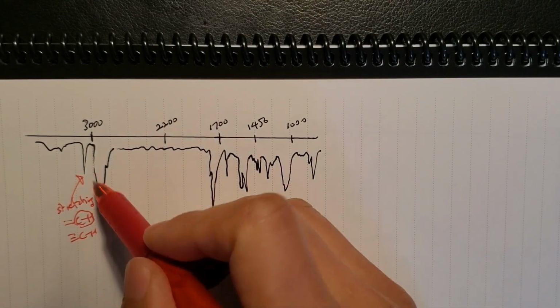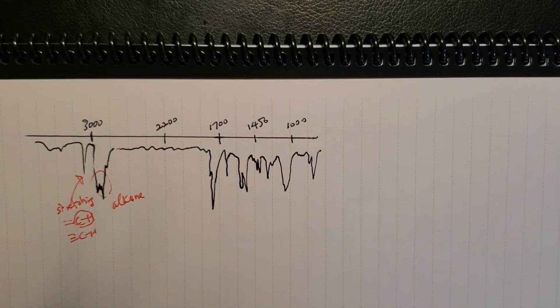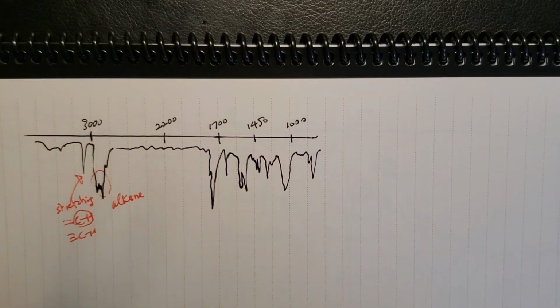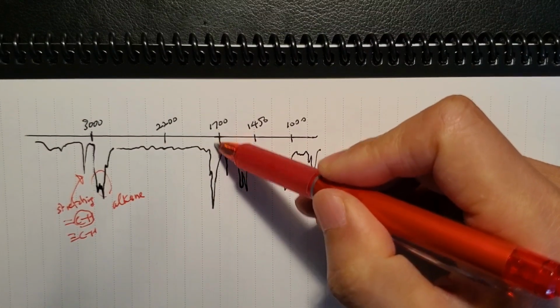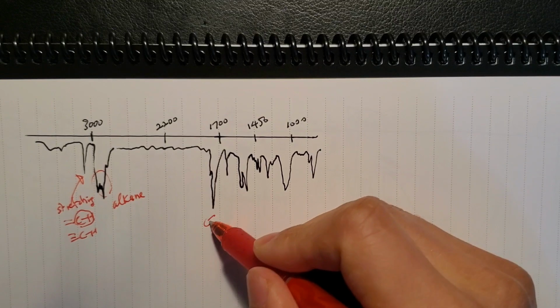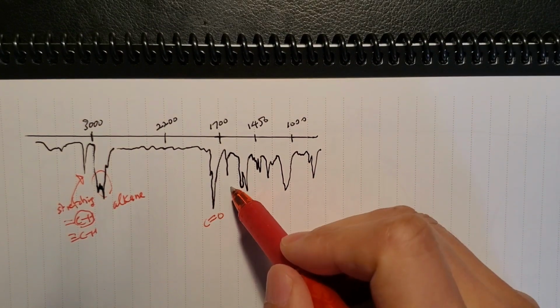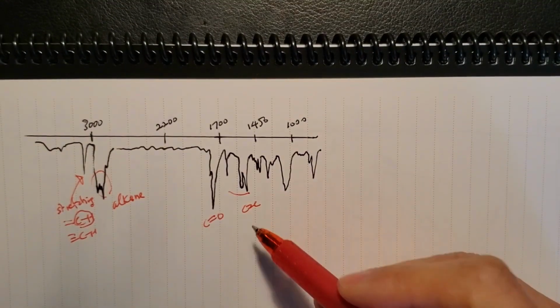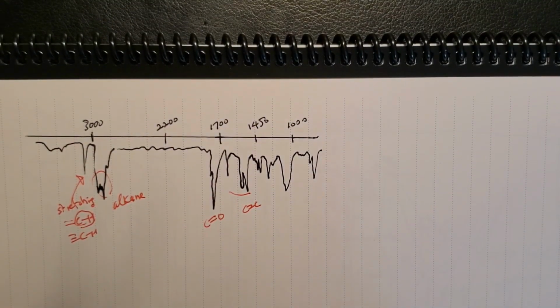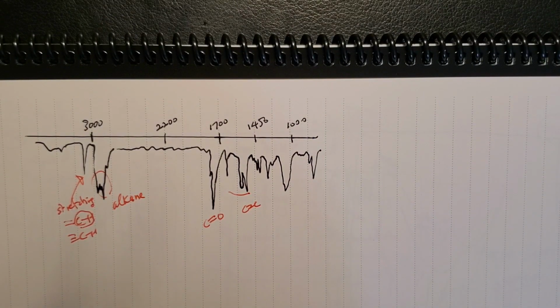Then all these bunch, those are the alkane area of the molecule, and I don't see anything near 27 or 28. Then you go to the signal here that's over 1700, so you give carbonyl group without knowing what it is exactly. Then, we also said earlier, we have a double bond. And when your idea comes this far, you have to check, like I mentioned earlier, whether this is aromatic or just alkene. Again, with the other spectrum, you want to double check.